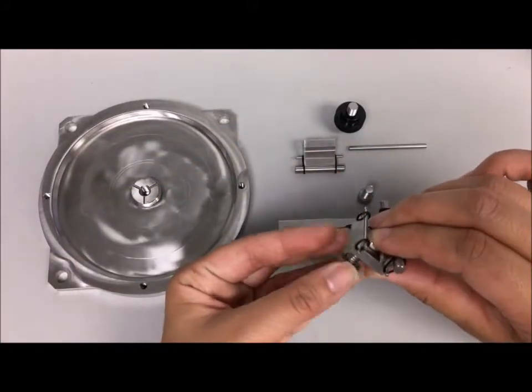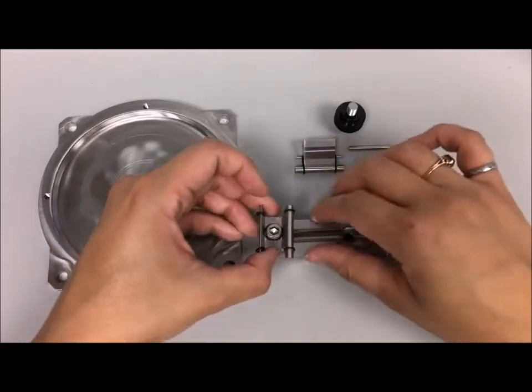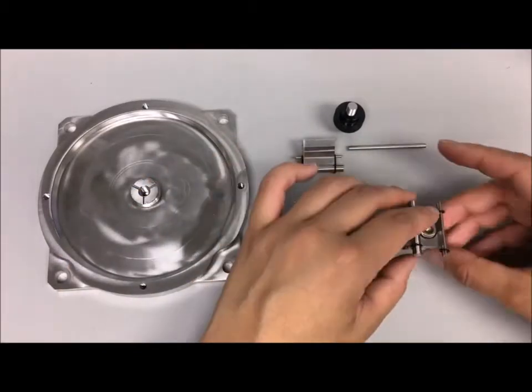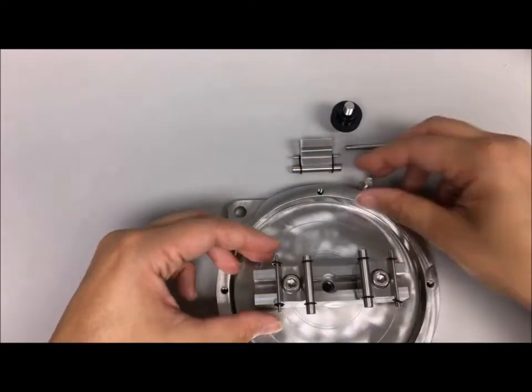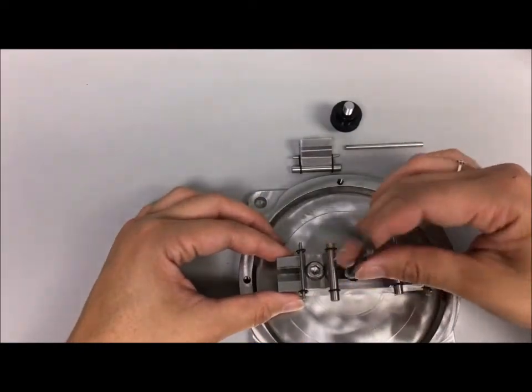Insert a screw in the hole of the three-point bending support and lightly secure with a square nut, then slide the three-point bending support into the three-point bending base. Do the same for the second support. Finally, screw the three-point bending base onto the testing chamber and ensure proper alignment.